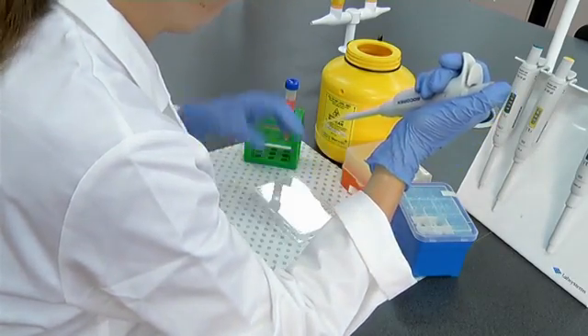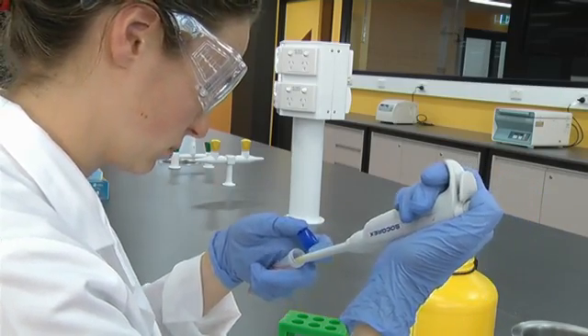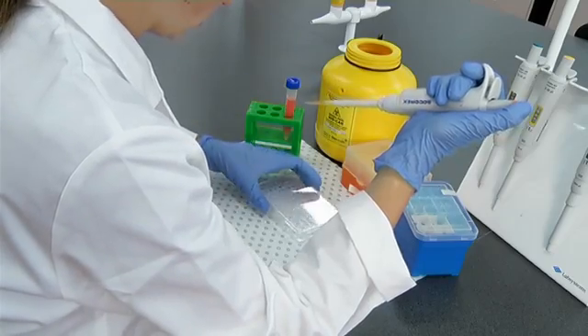The tip of the pipette can now be placed in the solution, and upon a gentle release of the plunger, a precise volume of the solution is drawn into the pipette tip. Once the solution is in the pipette tip, it can then be dispensed by depression of the plunger again.